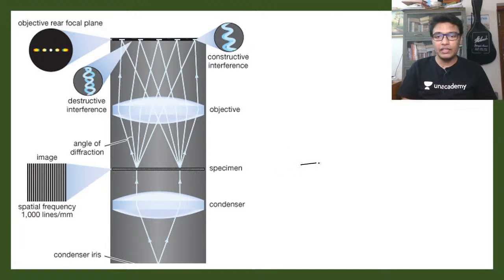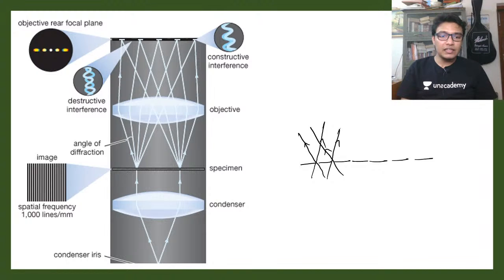In 2D, this would look like this. There would be black patterns, and the light can pass through here. The diffraction grating is here. The specimen is a grated, geometric specimen. The light would progress forward and ultimately be focused by the objective lens.